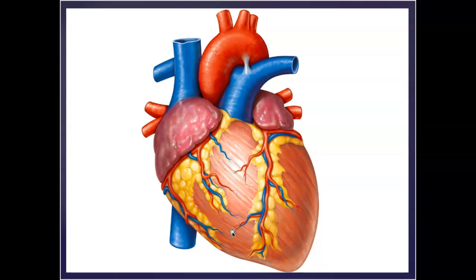Okay. Now, once you open up this ventricle, you'll want to clean out some of that old blood. Blood, as it gets in contact with the fixative solution, the formaldehyde and so forth, when the bodies were fixed, starts to harden, and it will almost take on the consistency of dried paint. It's kind of clumpy, and you'll take a blunt probe and you'll bring it over to the sink. We use a colander at the sink and use some warm water to soften up that blood and start to clean out the contents of this right ventricle.